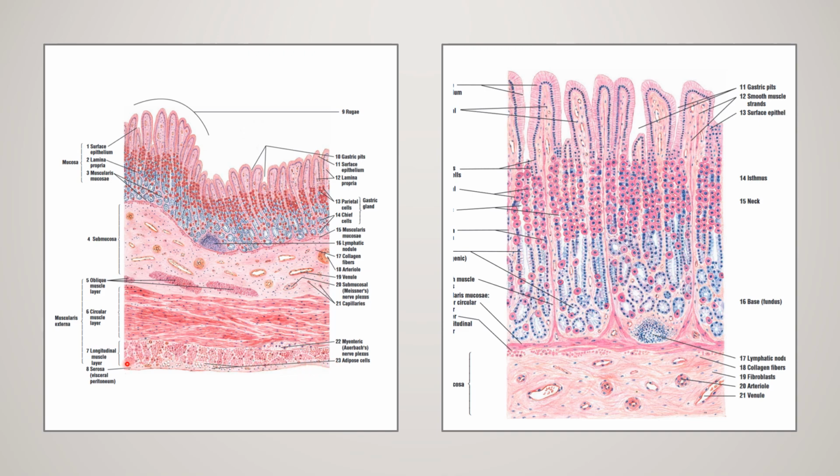In case of stomach, it is lined by peritoneum, so you will be having only serosa. So this is serosa. So we have four layers: mucosa, submucosa, your muscularis externa and serosa. So basic four layers are there. It is one of the slides of GIT. Adjacent to that, you are able to make out another image. This is low power, this is your high power.